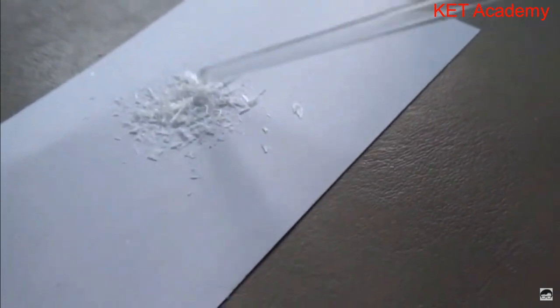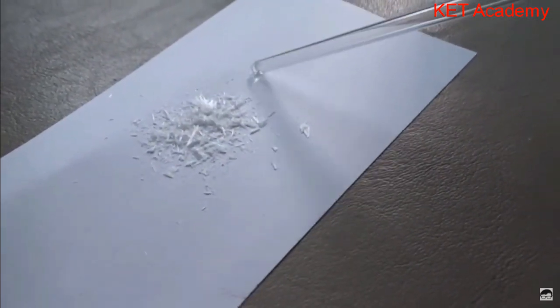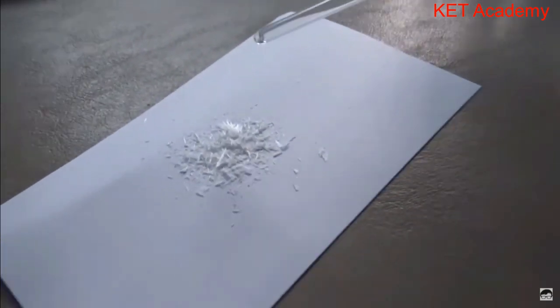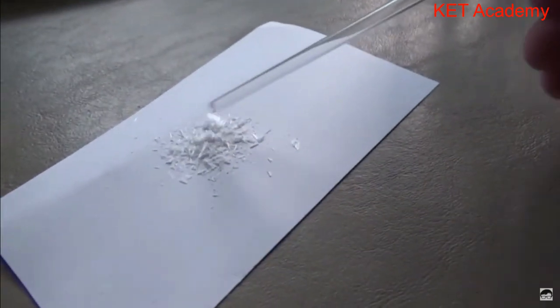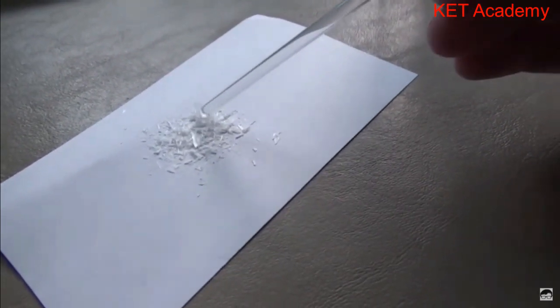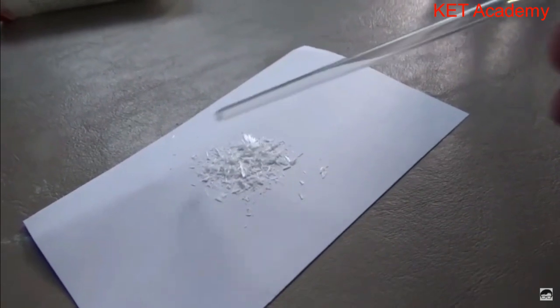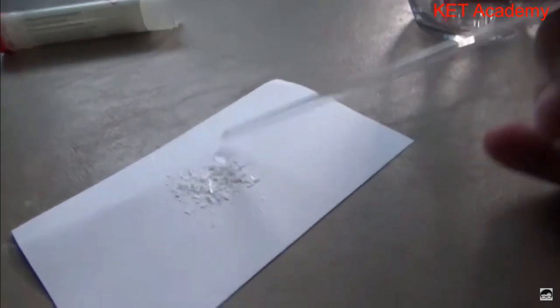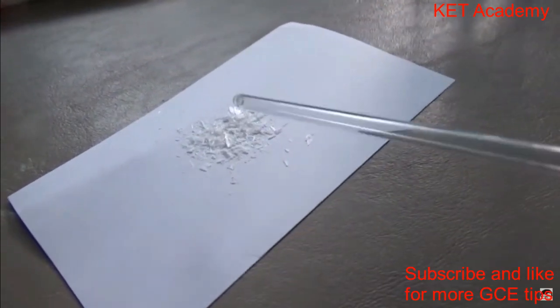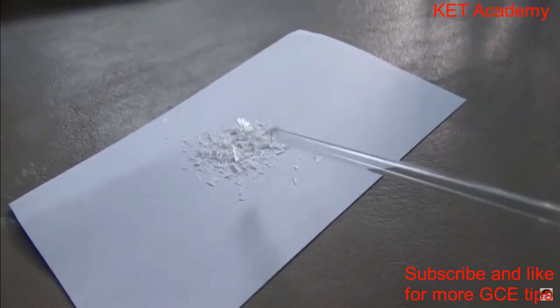My current hypothesis is that these are potassium carbonate crystals. Not 100% sure, but the last video I did was messing with potassium. I was extracting potassium from hardwood branches, right? And the compound would be, oh, actually, this is either potassium carbonate or potassium hydroxide.